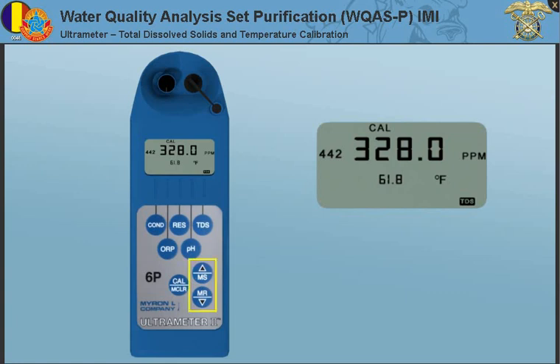Press MS or MR to step the displayed value toward the standard's value, or hold a key down to cause a rapid scrolling of the reading. Finally, press CAL MCLR once to confirm the new value and end the calibration sequence for this particular solution type.